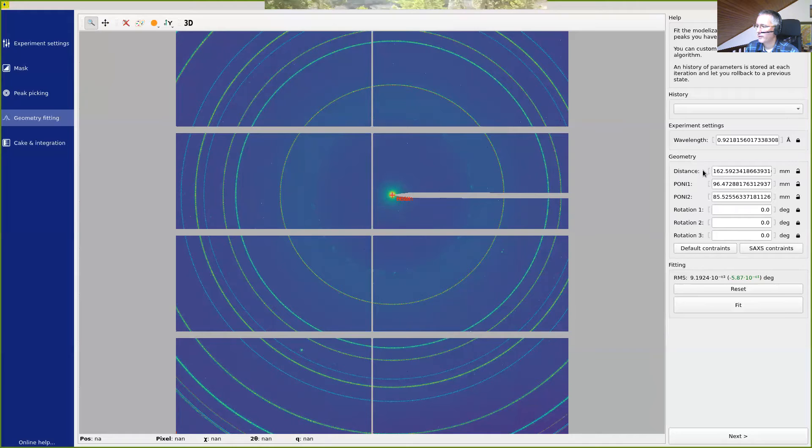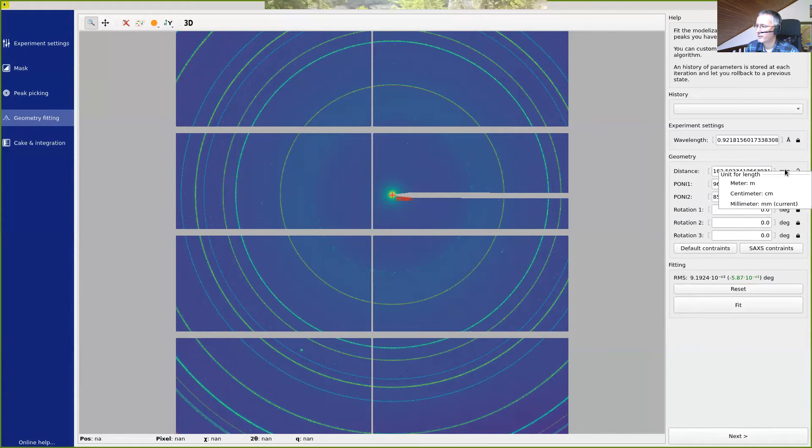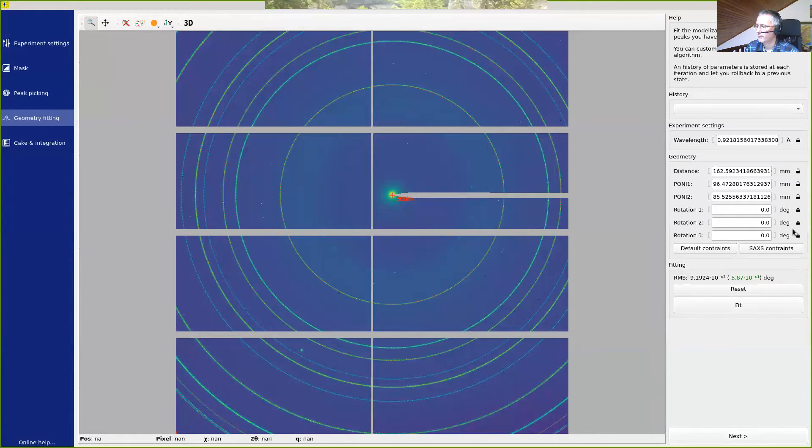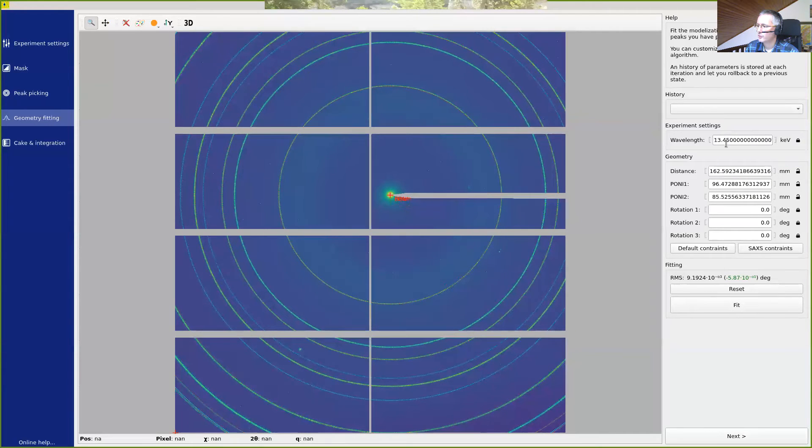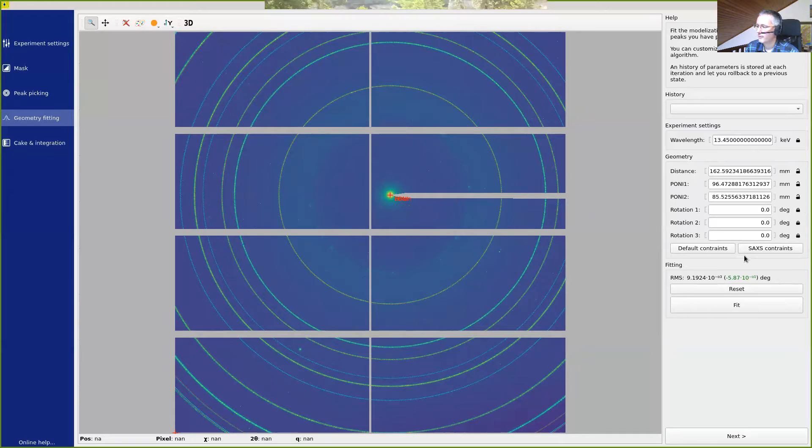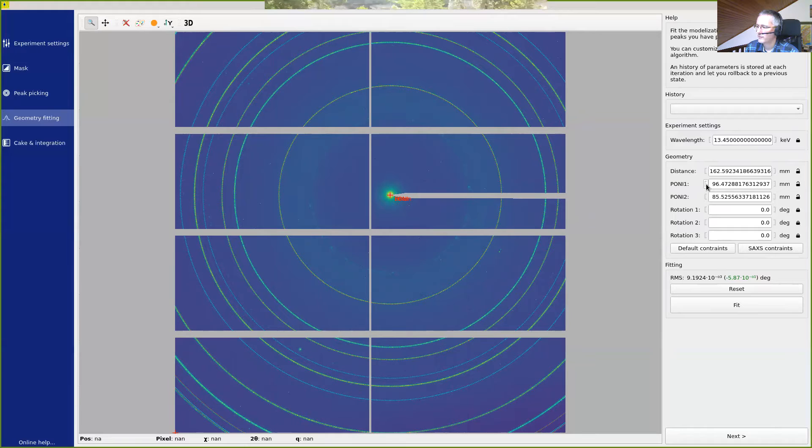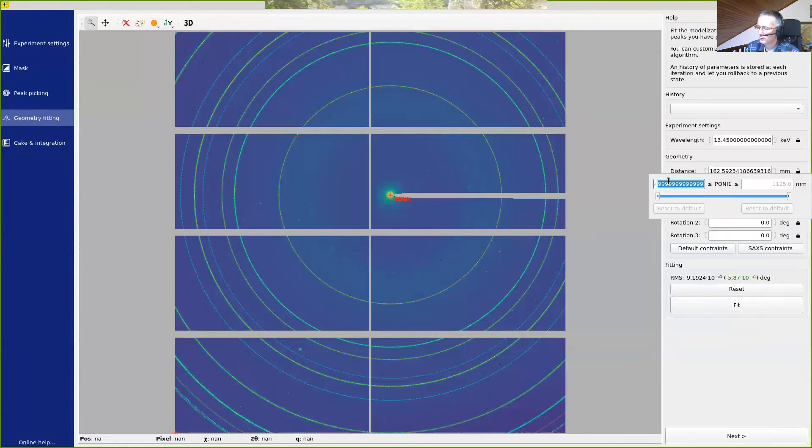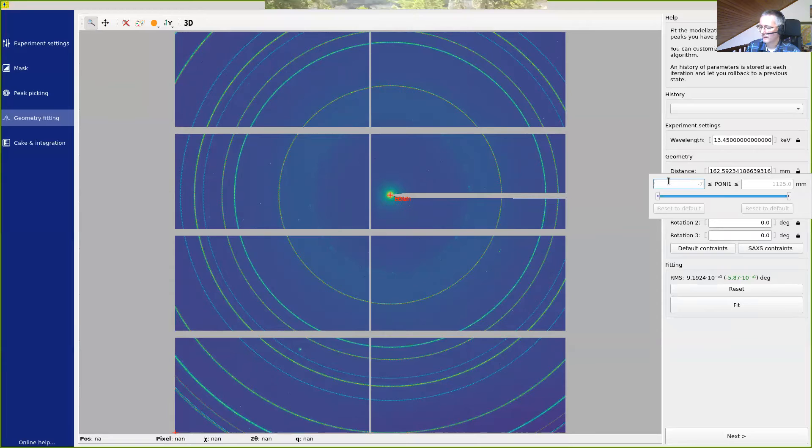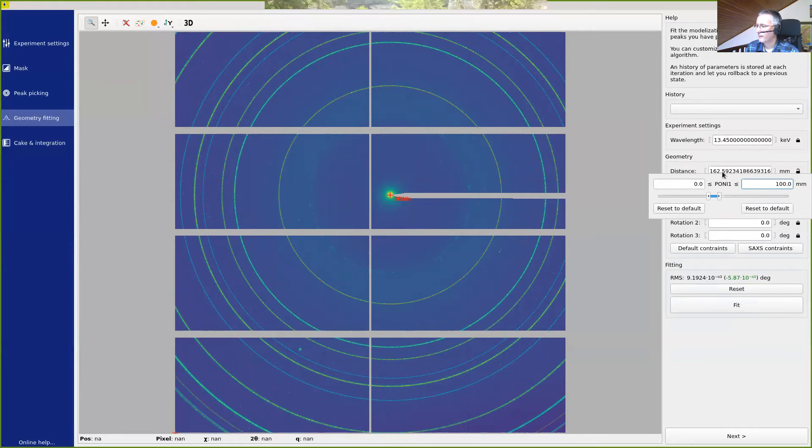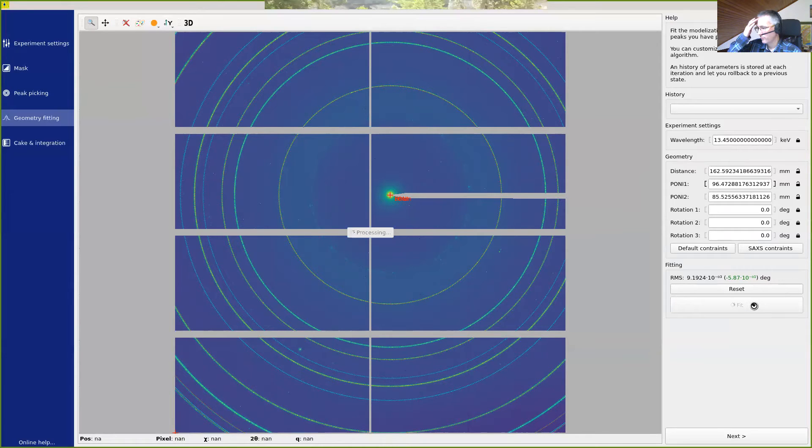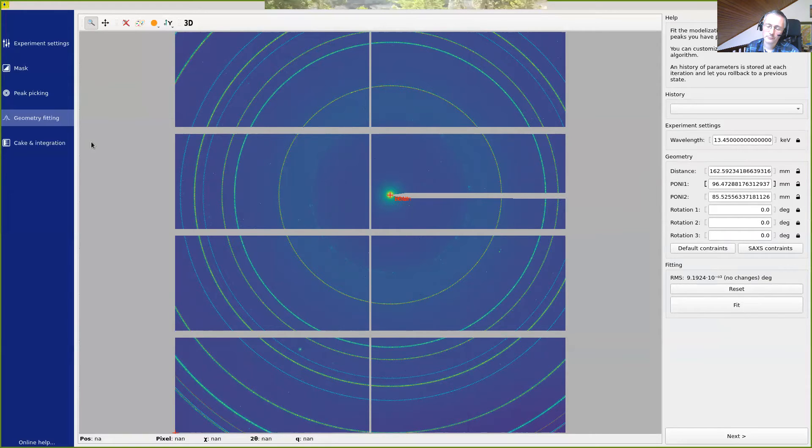We can also change the parameter we want to display for the units, for example, centimeters or millimeters. For the wavelengths, we can switch to energy mode, which will be 13 keV. And another thing, we may want to create some additional constraints. For example, we can limit the position of the pony between 0 and 100. By doing like this, we have added some extra constraints. Because 96 is within the range, it will not change anything. But this is already interesting to see.